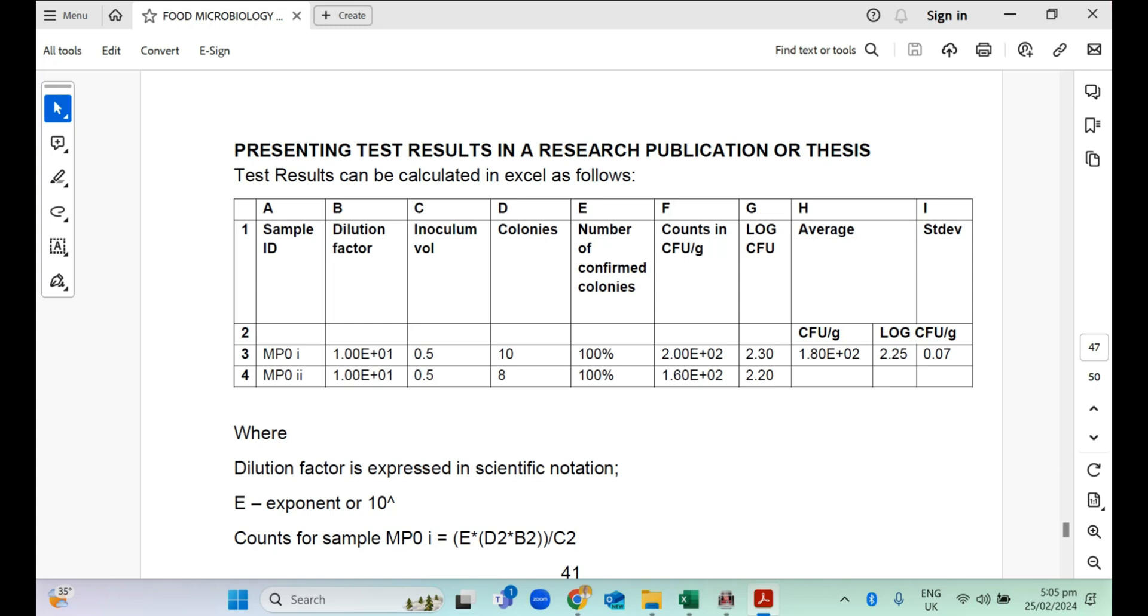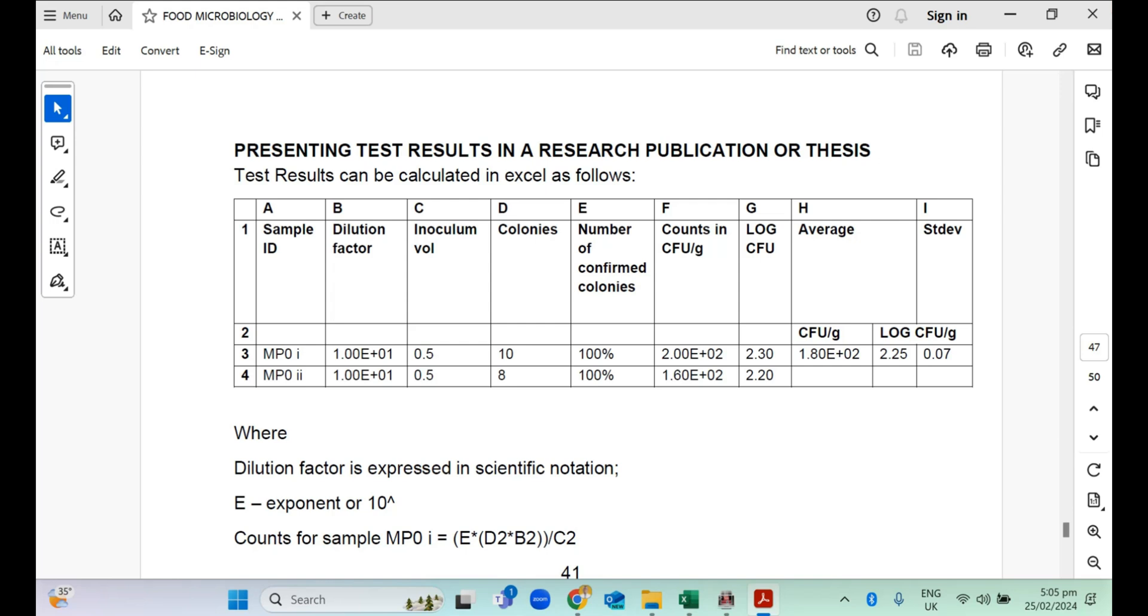Supposing that this is sample data we have. We have a column on Excel for sample ID and then we have one for dilution factor. We have inoculum volume, that's the amount of the sample you took onto the petri dish before the media was poured over or the amount you picked onto the agar surface to spread for culturing. And the dilution factor is how many times you diluted your sample.